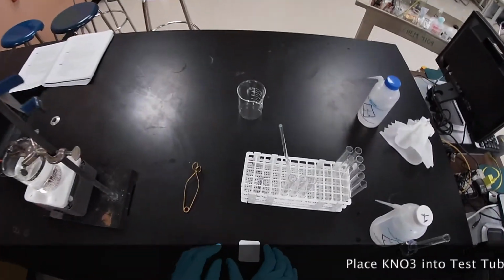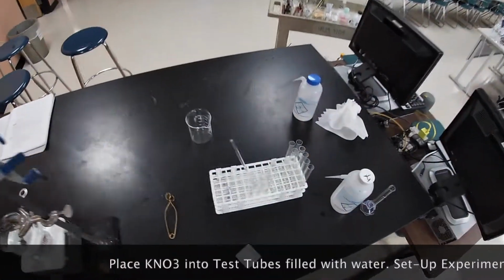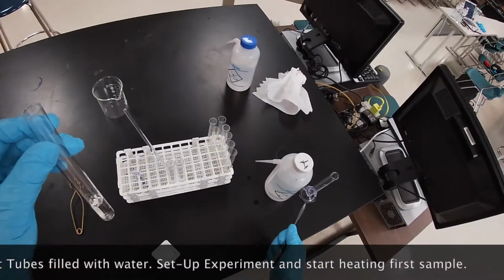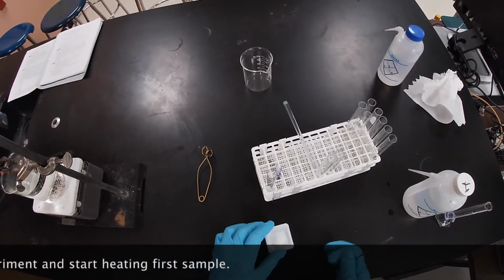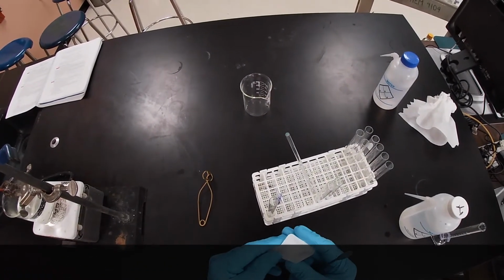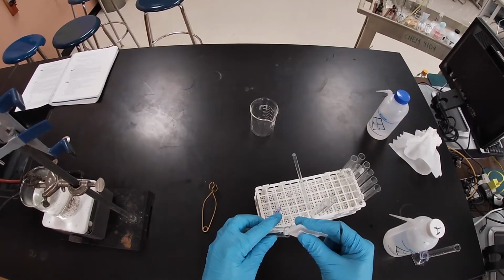Okay, so then we're gonna go ahead and add our sample. Let me get my spatula over here. We're gonna add our sample to our first test tube, and remember that our first test tube we measured out 5 milliliters of water. And so now we're just gonna go ahead and add our potassium nitrate into our water sample, our 5 milliliters of water.